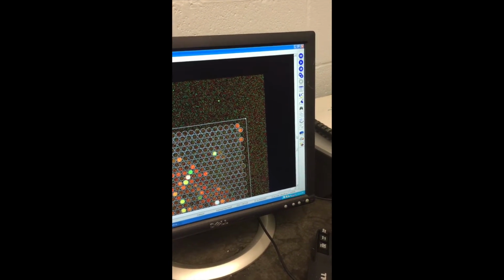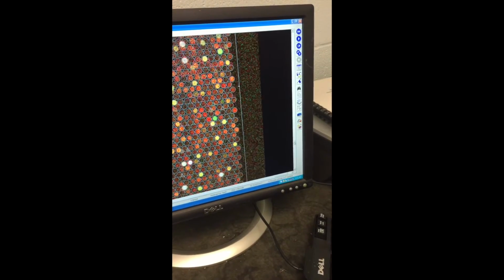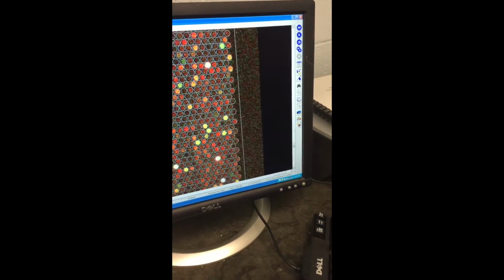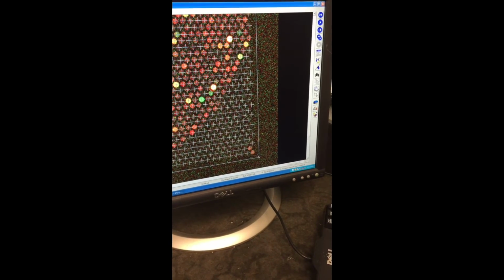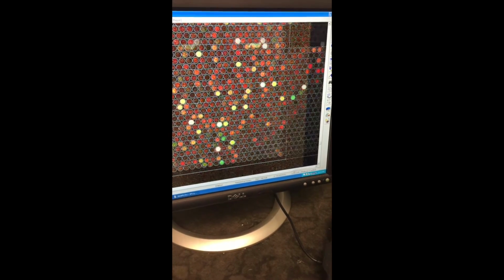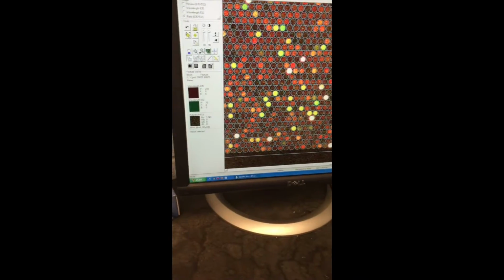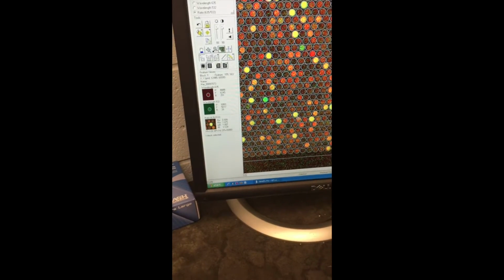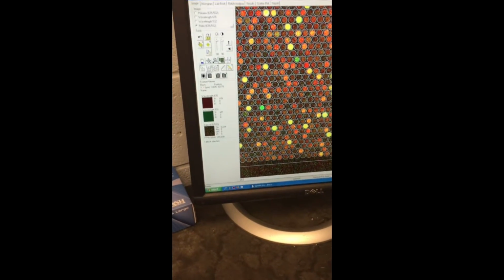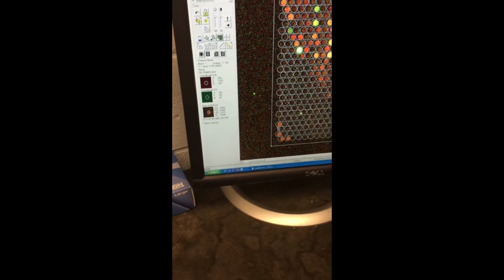Now I'm going to go down to this corner. And then you see, there's another place marker here. I'm just going to make sure that it's on it. And then I like to double check the corners. You can now see that almost everything is circled. So now the computer will tell you the intensity of each circle. So I'm going to take it on over. Like I said, I like to double check corners. So this one's just a little bit off.